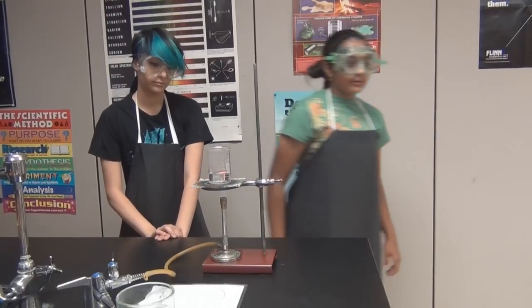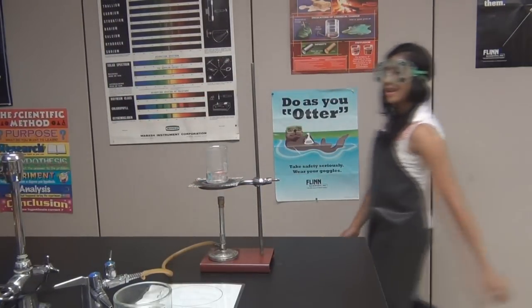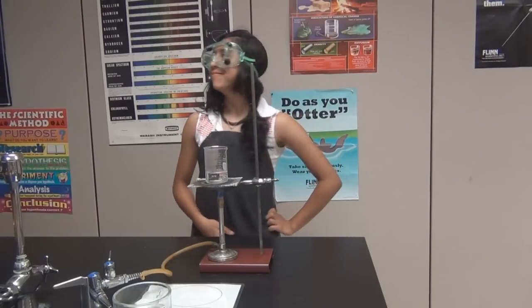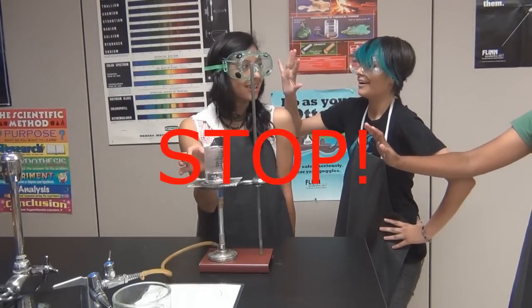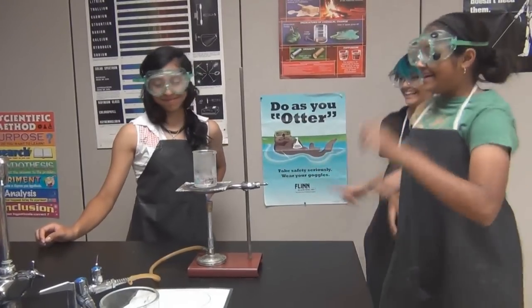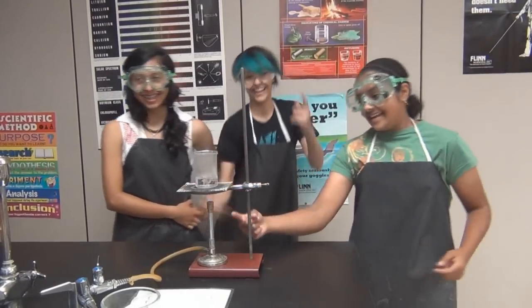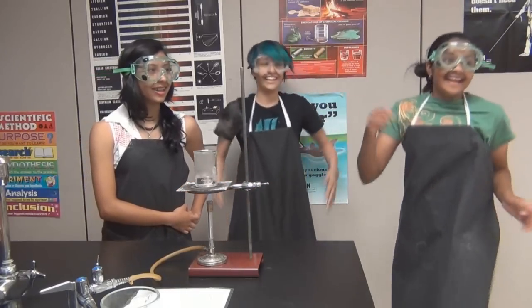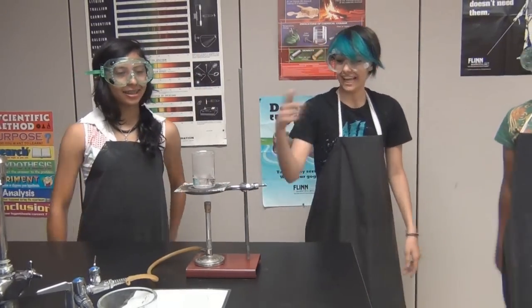Never leave the Bunsen burner unattended. Treat heat burns with cold water.